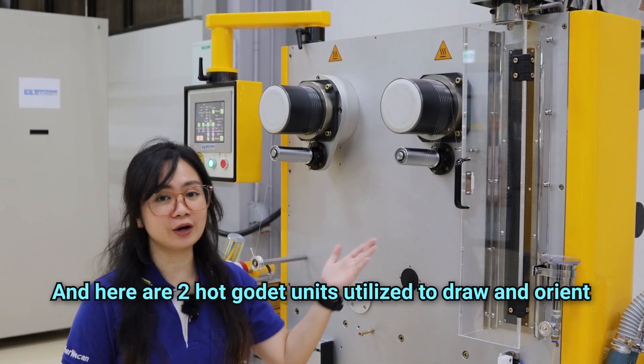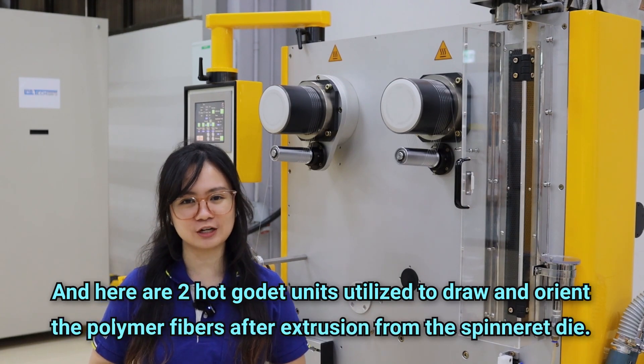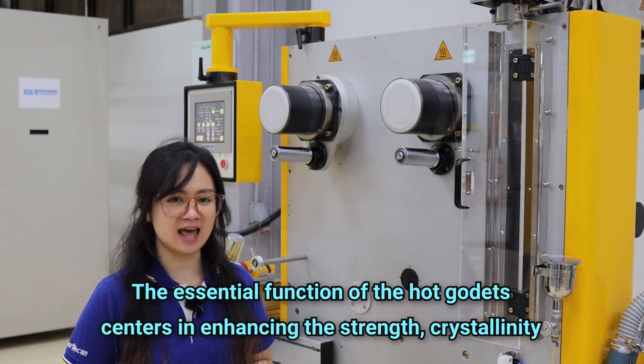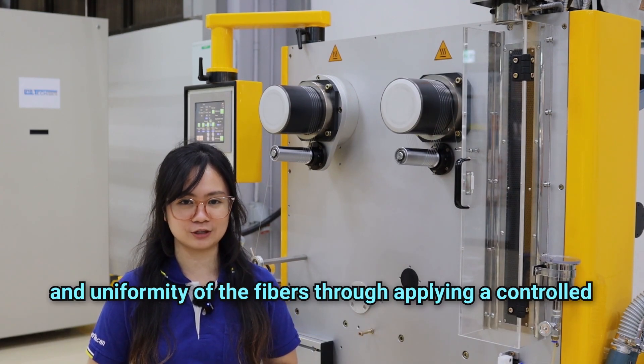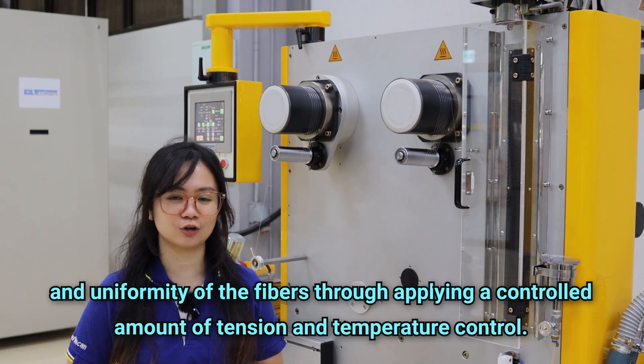Here are two godet units utilized to draw and orient the polymer fibers after extrusion from the spinneret die. The essential function of the hot godet rollers centers on enhancing the strength, crystallinity, and uniformity of the fibers through applying a controlled amount of tension and temperature control.